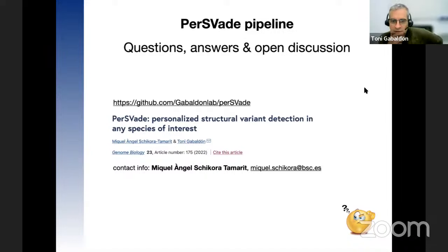Okay, thanks. Then another question by Yota or Obeta, I don't know if I pronounce it well. If I have two alternative reference genomes, one larger than the other one, which should I use? Regarding the reference genome, okay, if you have two alternatives, one for the same species, I guess.